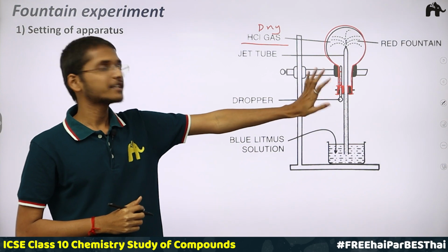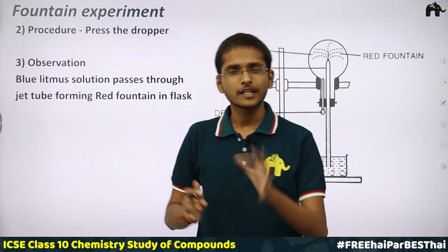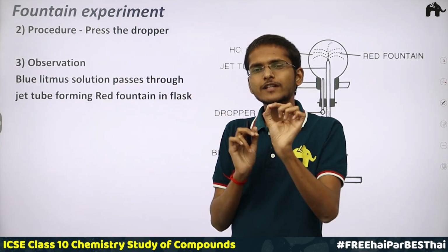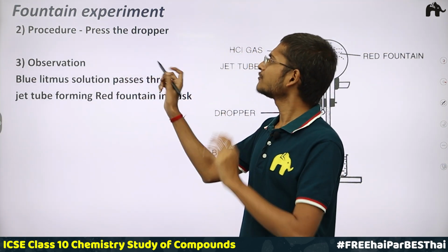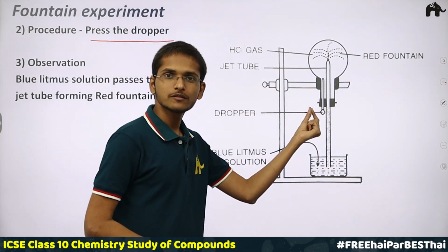Now this is very critical. We are going to use this dropper itself for carrying out the reaction. Clear? Okay, now let's see the procedure. Only one simple thing we have to do, just press the dropper. Okay, so now I'm pressing this dropper.